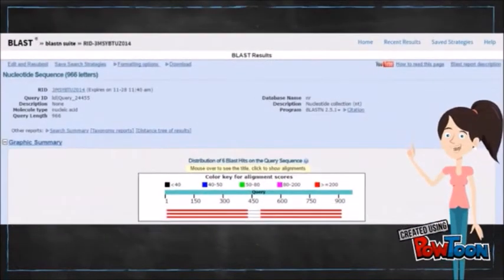Results usually come out in a moment. However, if you have registered on NCBI, the results can be obtained in shorter time. Otherwise, you will have to wait.